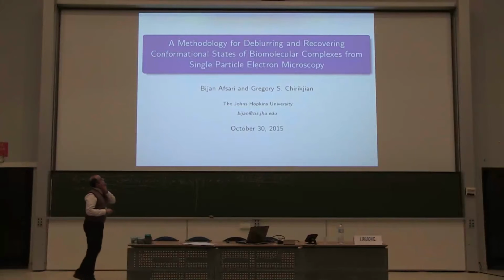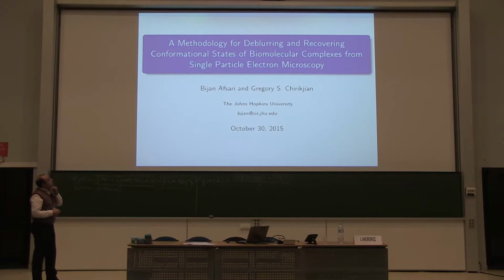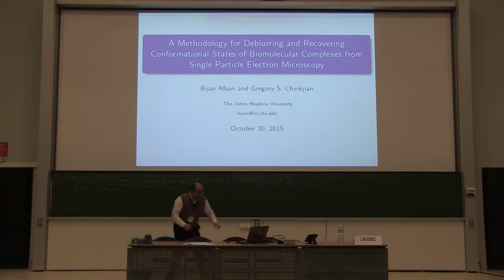So the title of the talk is rather long: a methodology for deblurring and recovering conformational states of biomolecular complexes from single particle electron microscopy. I will explain some of the terms here.